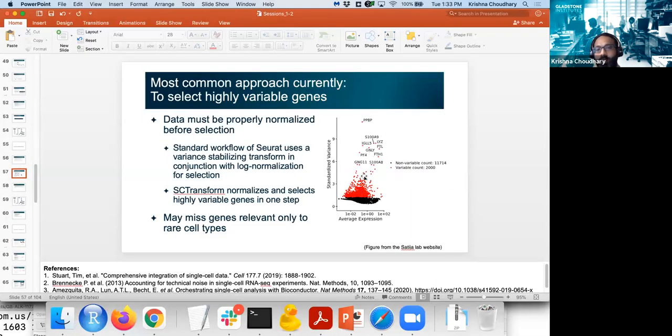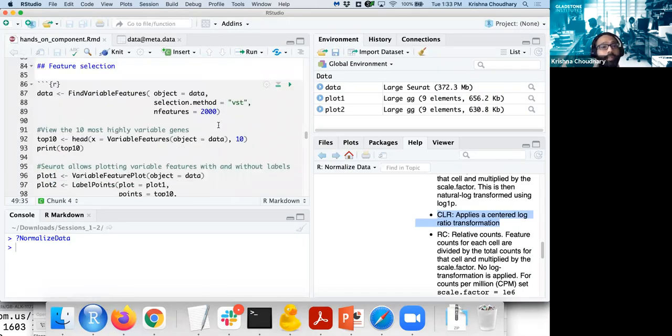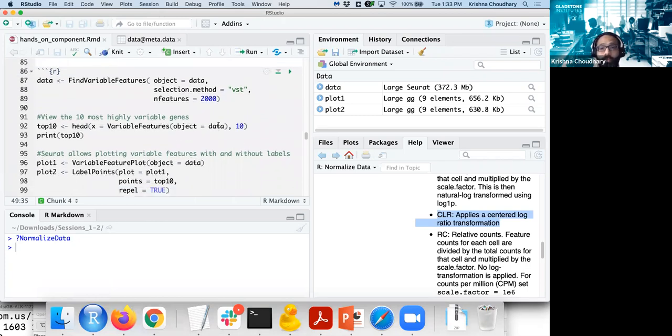So this figure on the right is illustrating the selection of the genes. And if you have any question, please ask now. I hope I'm making sense. I won't know unless someone lets me know that I'm not making sense. So I'm happy to repeat whatever I've said. But someone has to say that I did not make sense. So, okay.